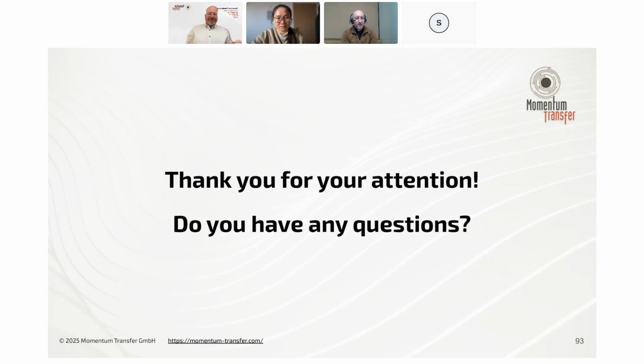Yes. So what I was looking for, I'm basically a microscopy person. There was a STEM PDF method developed by Professor Christian Kübel from KIT. What they do is record nanobeam diffraction patterns as a function of probe position. If you have a very highly converged probe, for example sub-angstrom or one angstrom, you have the Bragg disk overlap on the back focal plane, which complicates your PDF analysis.